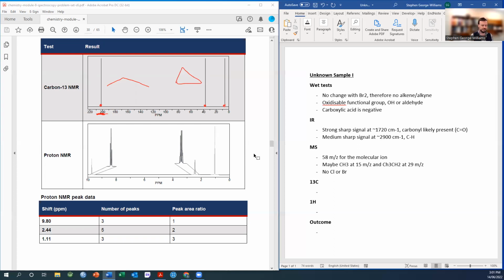After that, I knew I had a carbonyl, which told me that my carbonyl could either be here, or I'll draw this example over there, here or here. So I have 3 possibilities for my carbonyl. The left 2 examples are ketones. And as you can see, they actually have symmetry down the molecule, which would mean that these carbons would be in the same environment. So there'd only be 2 carbon environments for those ketones. However, this aldehyde, with its lack of symmetry, has 3 carbon environments.